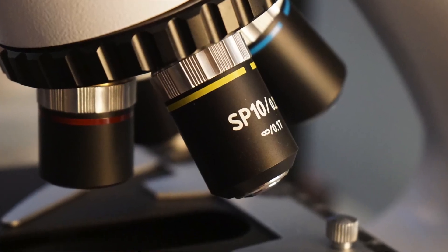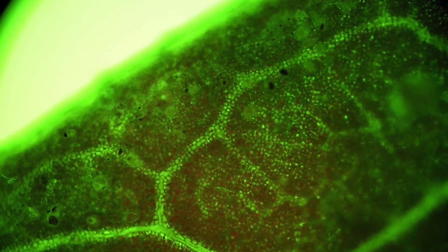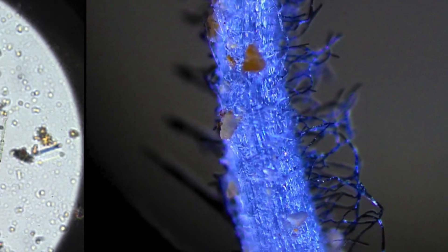Do you want to learn how to use one of these? A microscope? If you'd like to learn to use a microscope to examine your plants, the soil, the compost, even if it's just bright field, this is the program for you.